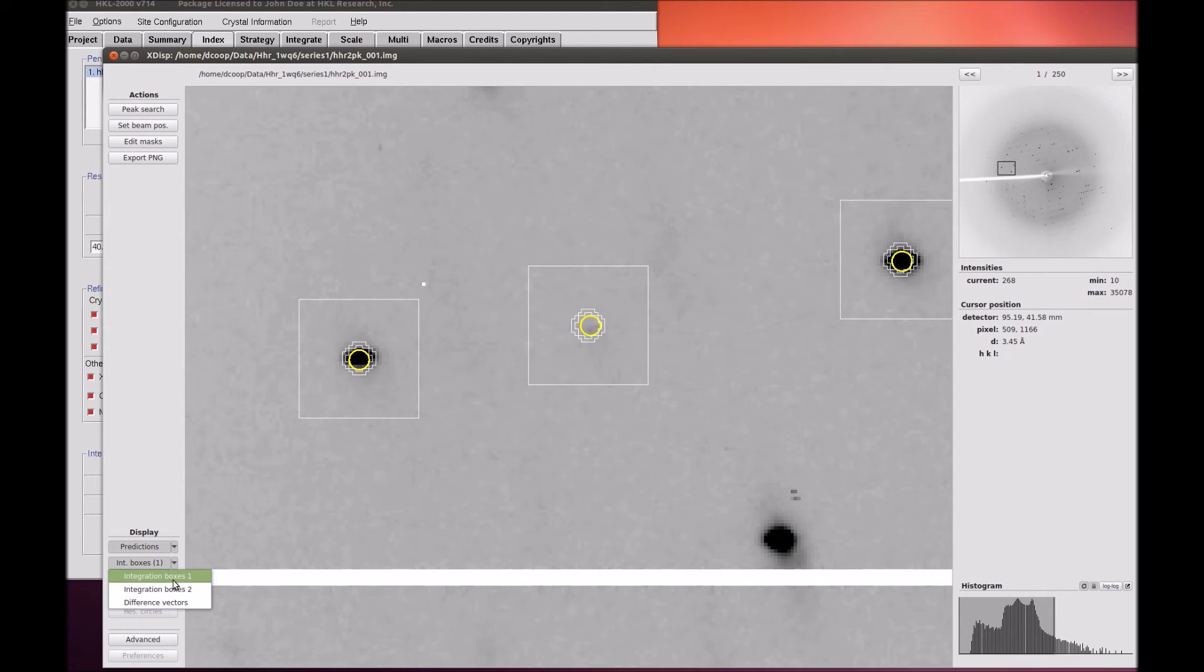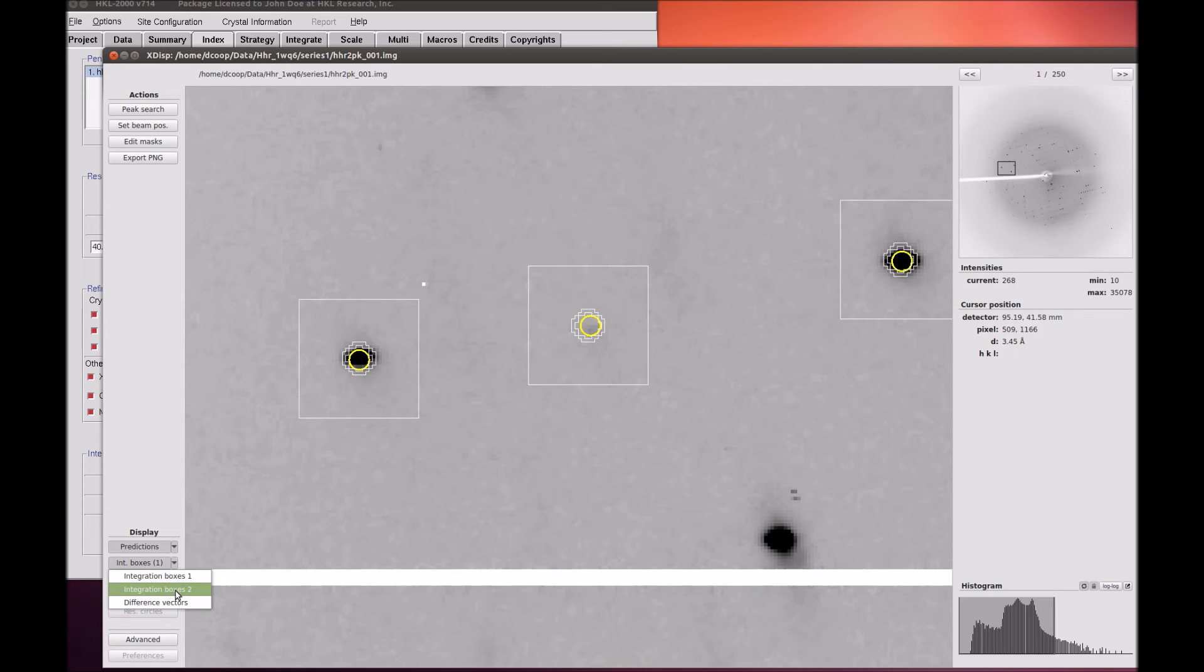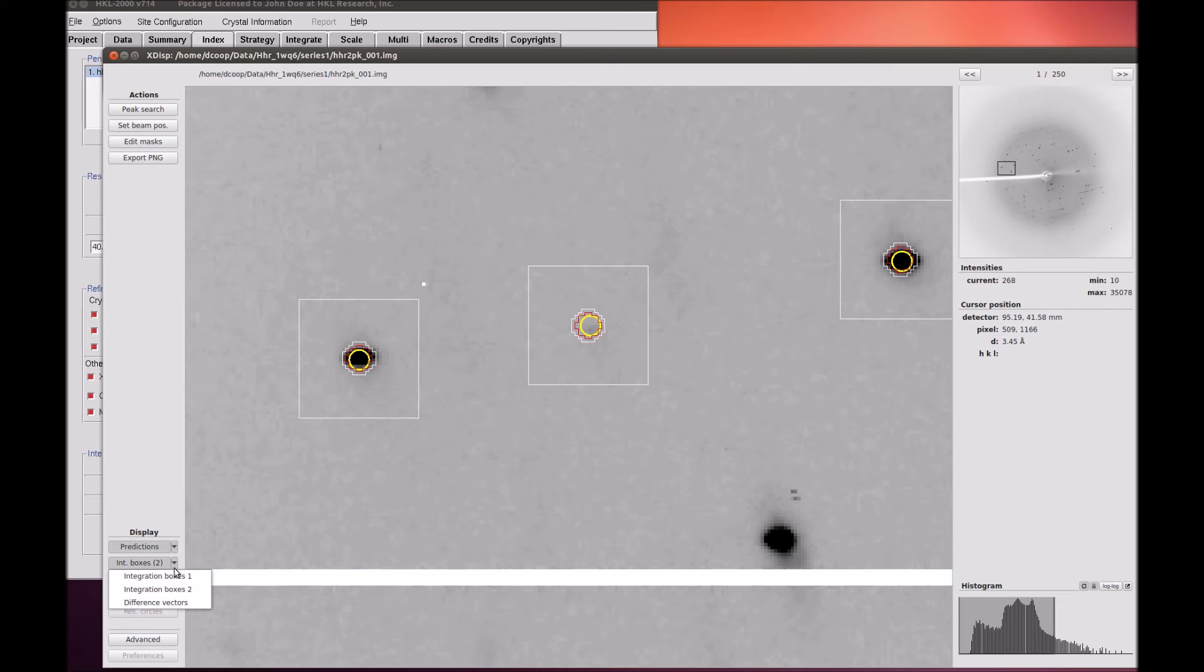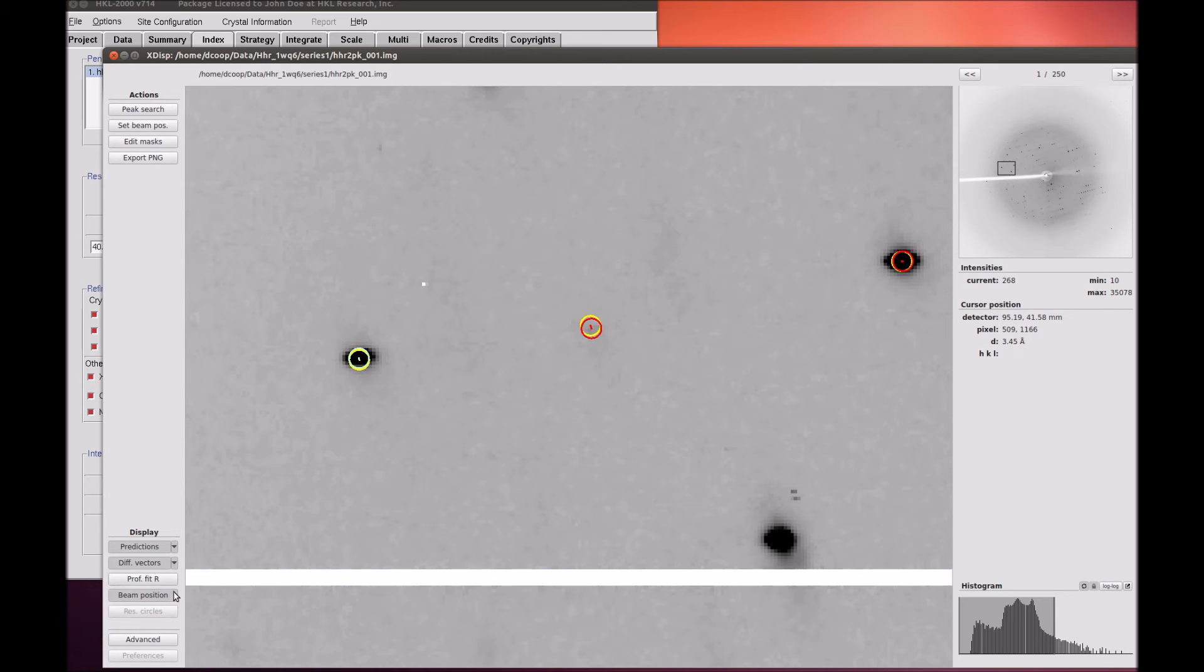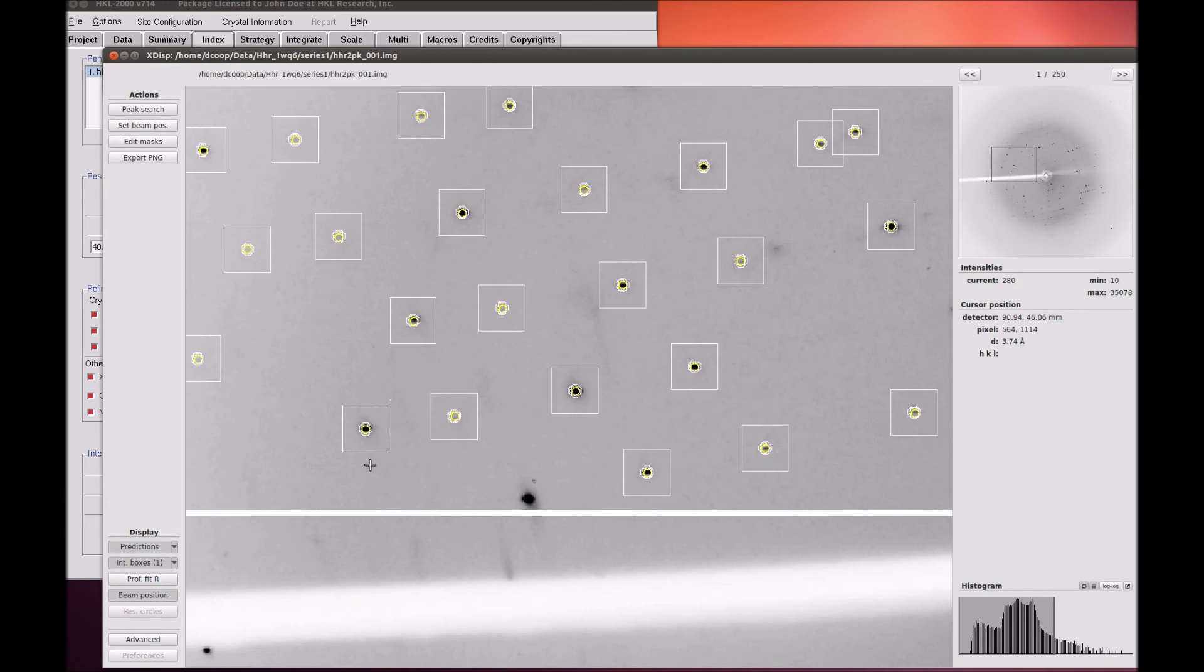XDispQT has two ways of coloring the inner circle, which can be selected using the Integration Boxes 1 and 2 options using the Select drop-down associated with this toggle. Selecting the Difference Vector option will show difference vectors between the peak maxima and the center of the predicted reflection.